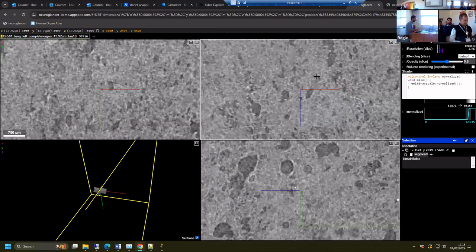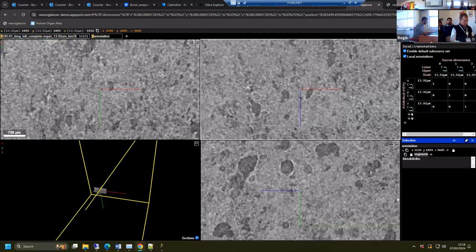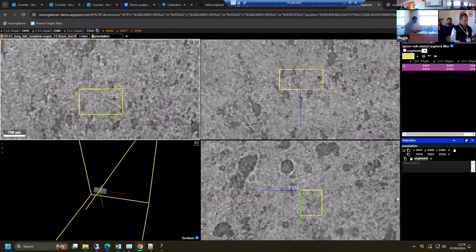And what's cool with this is that it's web-based, so you can quickly share it between collaborators, and you can quickly do analysis and look at interesting areas. You can even do annotations, where if I succeed to make it work, yeah, for example, here, maybe I will dezoom a bit first.